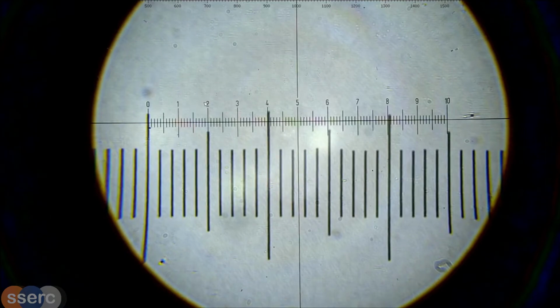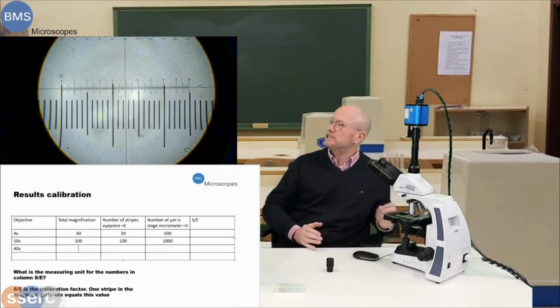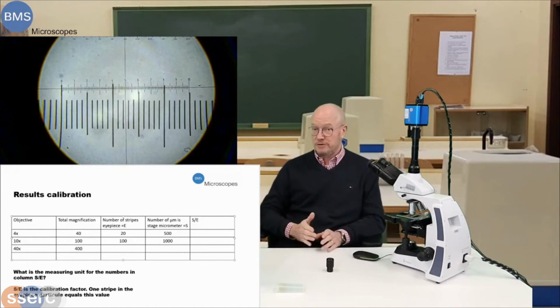If I look at it, it's proper to go from 0 to 4 here, and it equalizes exactly one major part in the stage micrometer, which is 100 microns, equalizing 40 units in the graticule. So total magnification is 400, 40 times 10. The number of stripes in the eyepiece is 40, and the number of micrometers is 100.